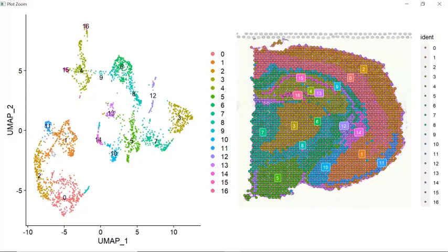Also, clusters in similar tissue areas will be placed next to each other. We've now finished the basic analysis for the spatial sequencing data set. I'm going to stop here today for this video.